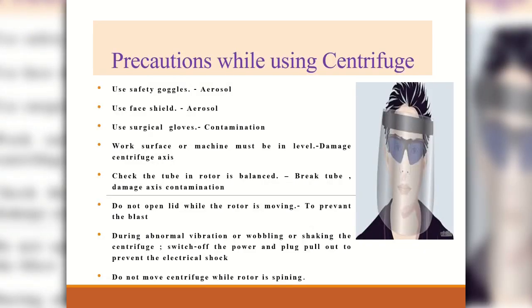And these are the precautions while using a centrifuge. Use safety goggles in order to prevent aerosol. Use a face shield in order to prevent aerosol. Use surgical gloves in order to prevent contamination. The work surface or machine must be level to prevent damage to the centrifuge axis.